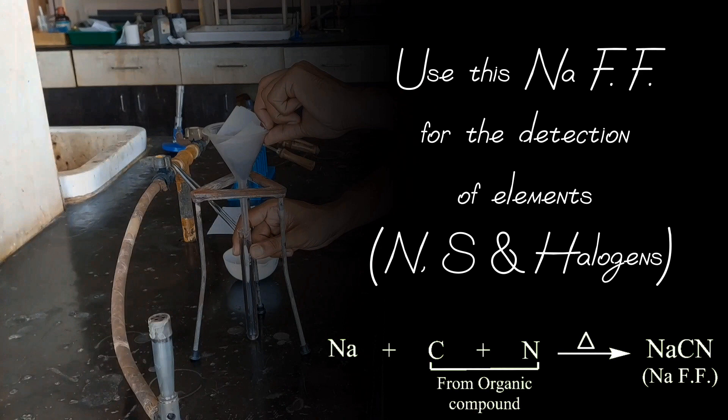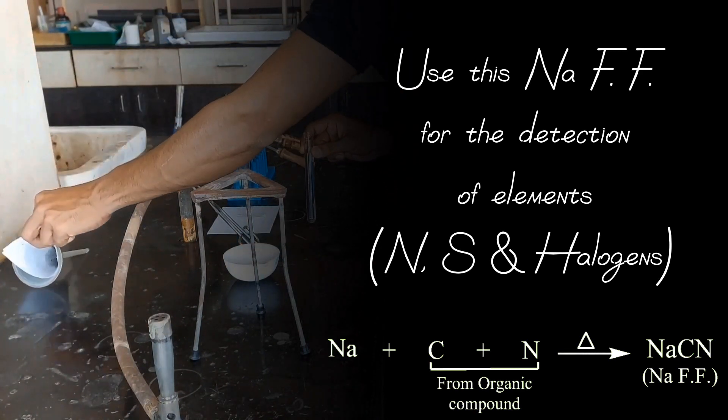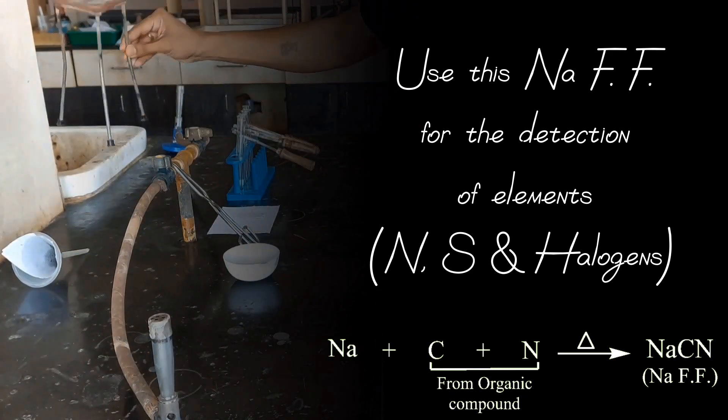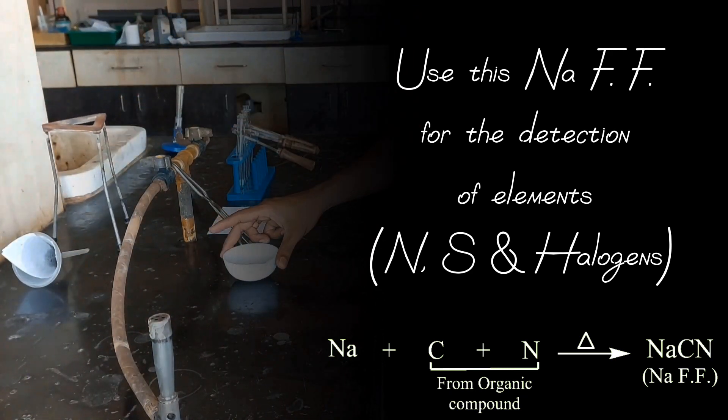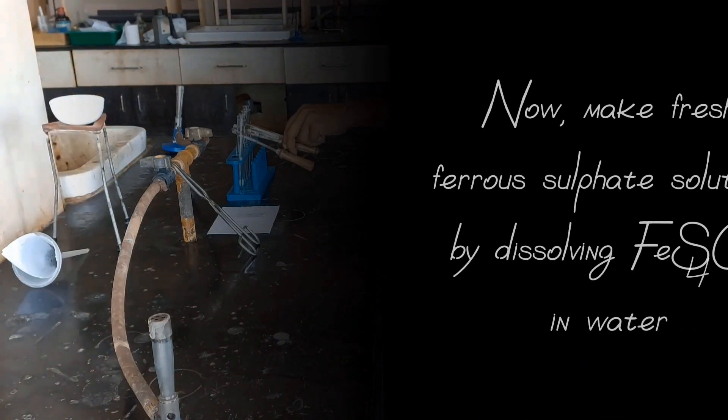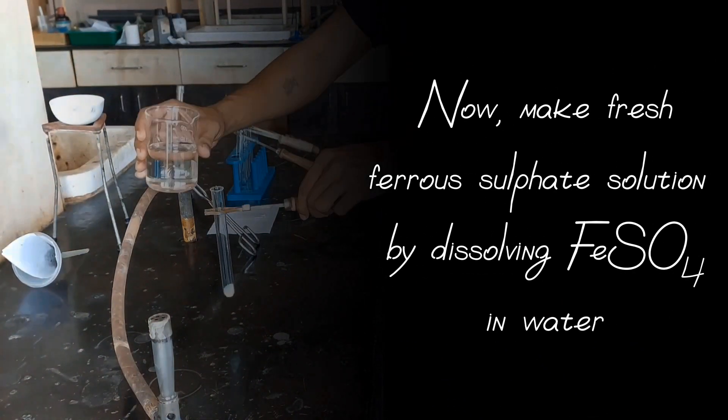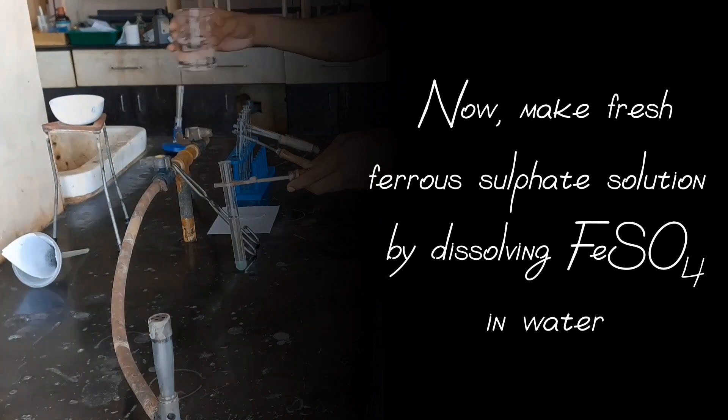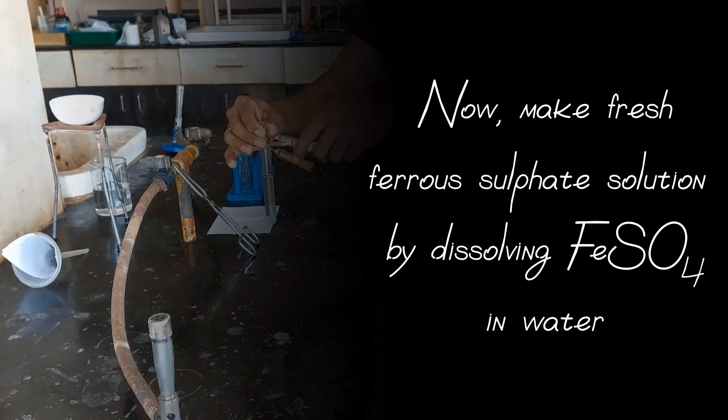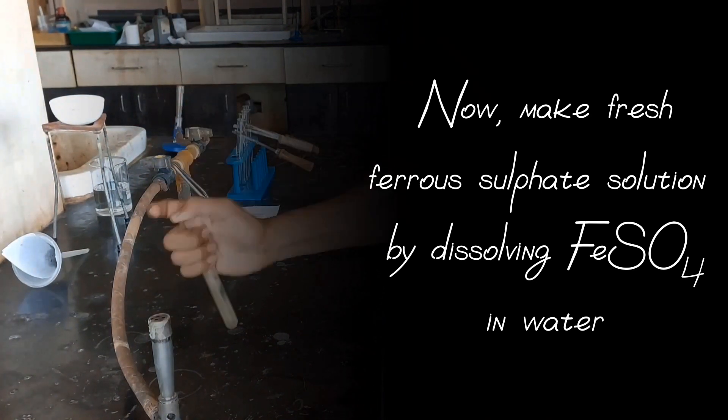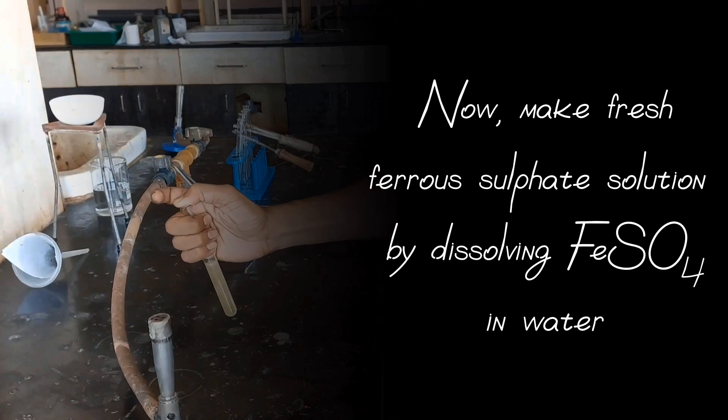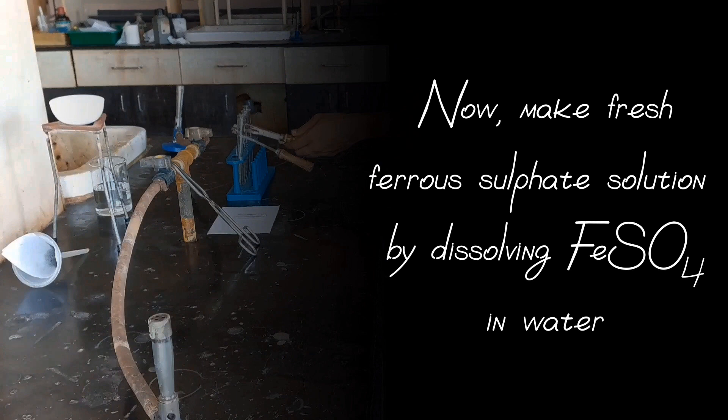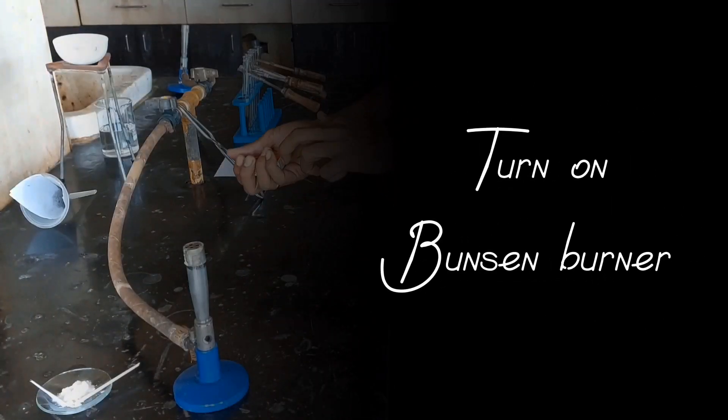Use this sodium fusion filtrate for the detection of elements like Nitrogen, Sulphur and Halogens. Now make fresh ferrous sulphate solution by dissolving ferrous sulphate in water. Turn on Bunsen burner.